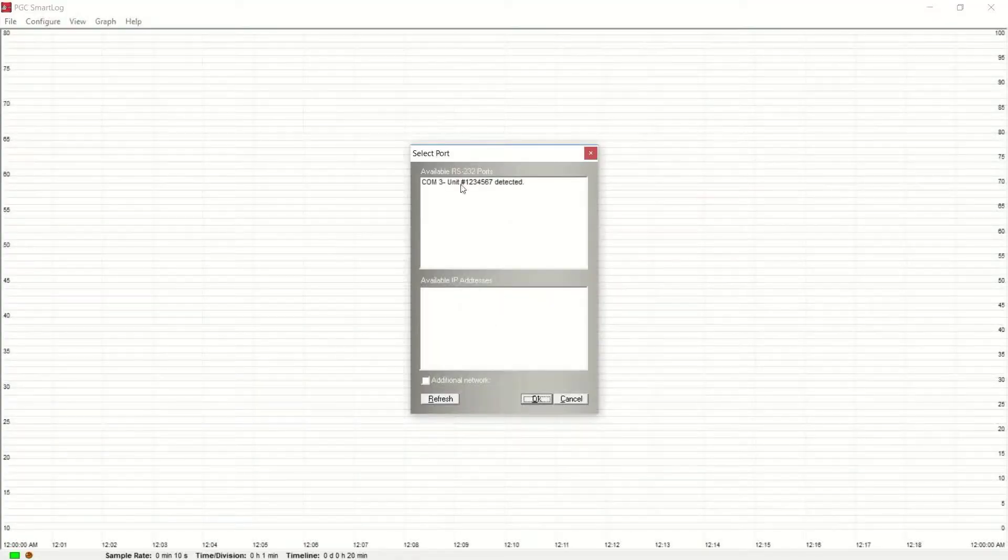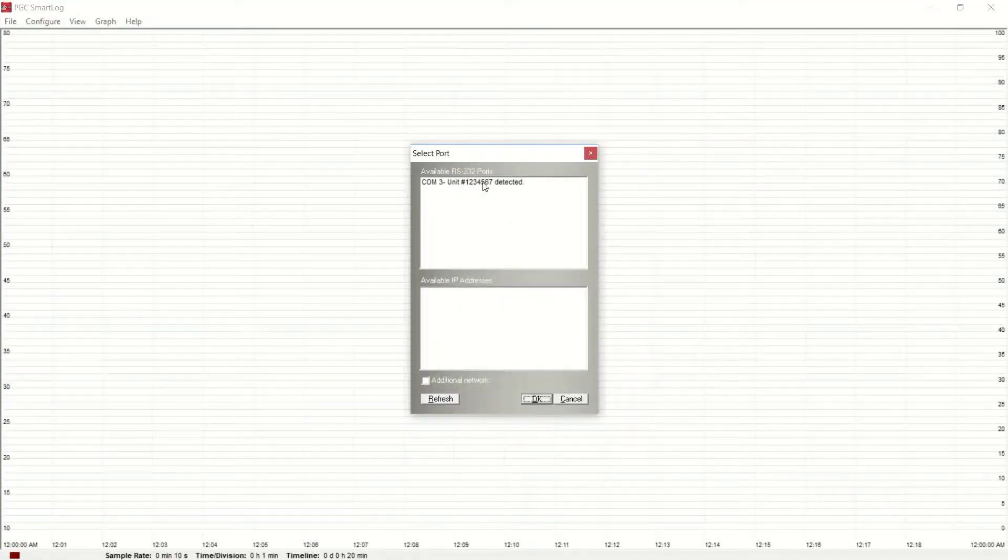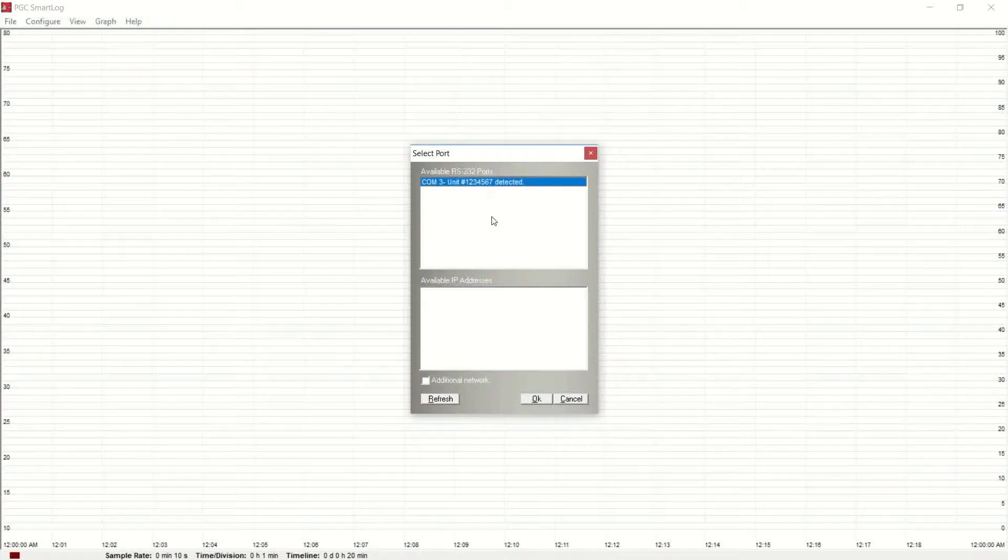SmartLog will prompt you to select the serial number of the connected parameter unit. Select your serial number and then click on OK.